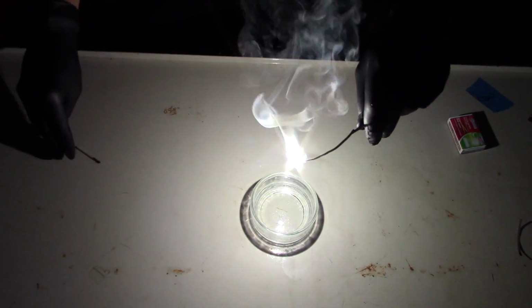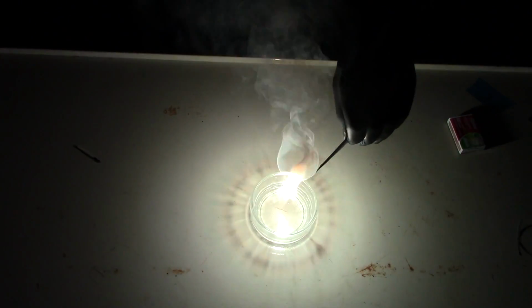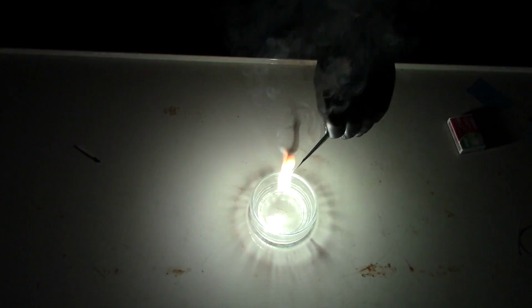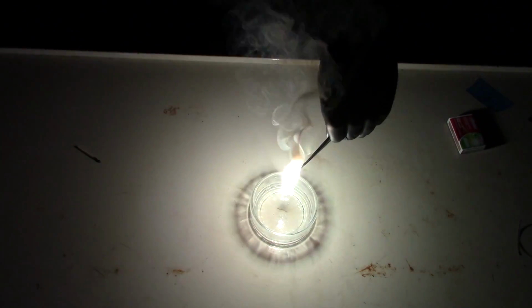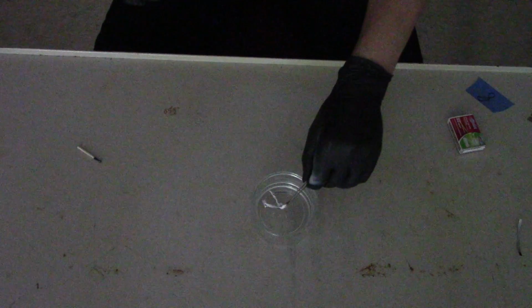There we go. So it's very bright because it's magnesium. Yeah, it's like a sparkler. Sparklers have magnesium in them and a few other things. Boy. But when it's all done, why did I look directly at it? When it's all done, you can turn the lights on for us. Thank you very much. That ribbon is still here, but it's a different material now. It's magnesium oxide.